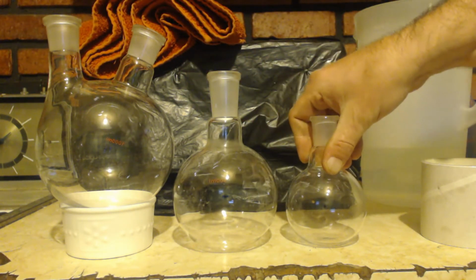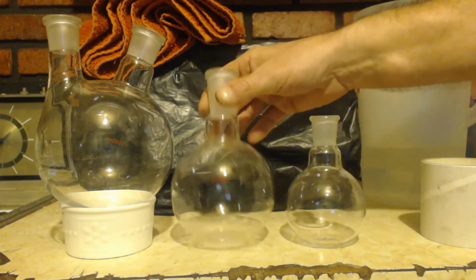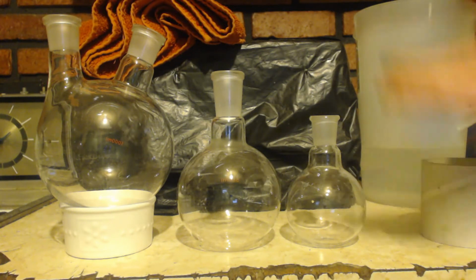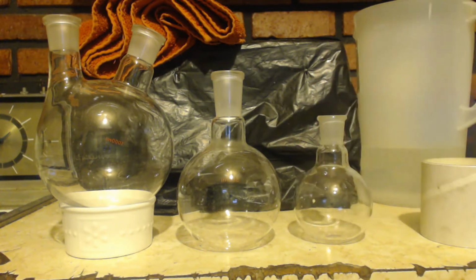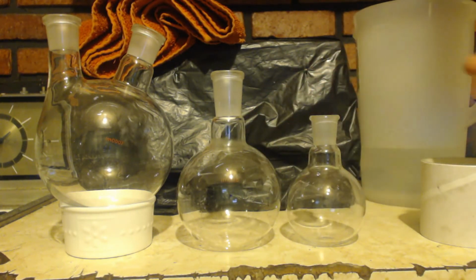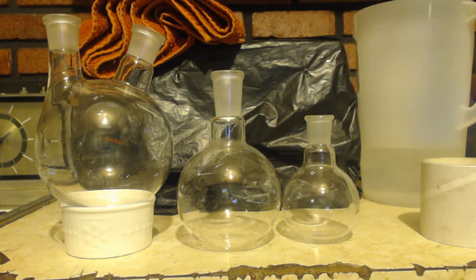Just for aggravation's sake, you can buy flasks that sit on the table that are flat on the bottom. That way it's not such an inconvenience not being able to set your flask down on a table somewhere. You know what I mean? If it's too hot for the table where it might break, you can put a cloth down and still set these down. I know that if a sphere is the perfect structural shape, and you're losing some structural integrity there, you ain't losing that much. It's not worth the aggravation of not being able to set them down anywhere.